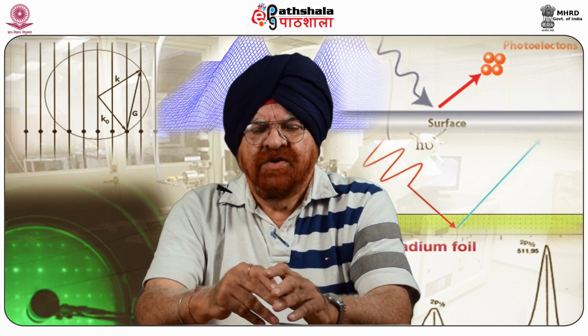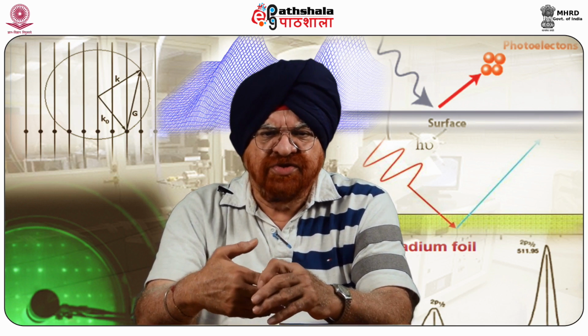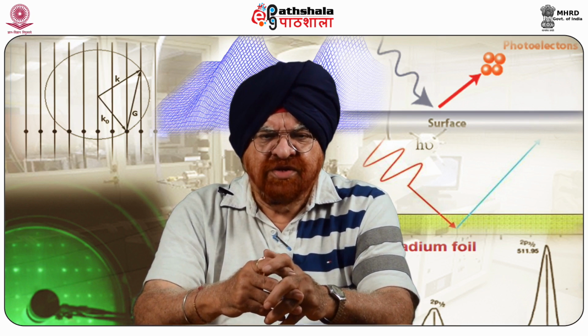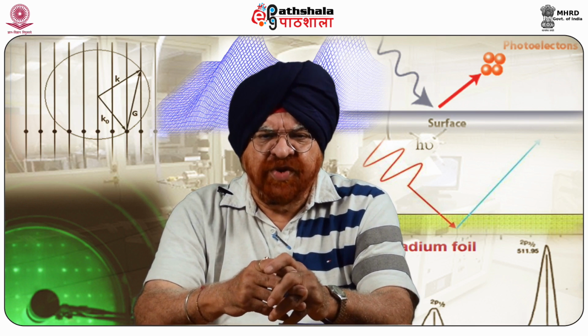So students, after having learned about the basics of this spectroscopy called ESCA, we can now summarize, because we are in a position to do that. When we summarize this particular module, we learn the following: Kai Siegbahn, a Swedish scientist, and his research group in Uppsala, Sweden, recorded the first high energy resolution ESCA spectrum of sodium chloride, and this was done way back in 1954.